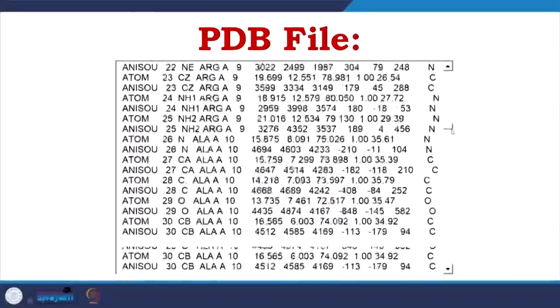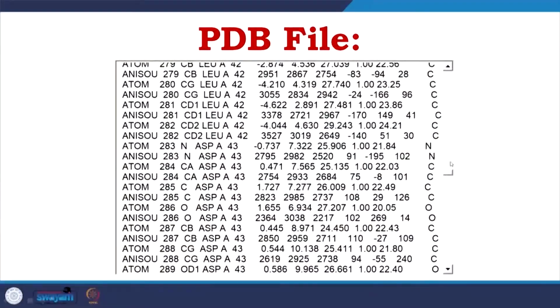How big is it? For an average PDB file, if you copy the file and paste it to your Word or Notepad and make the font 10 to 11, you will get 50 to 60 pages.